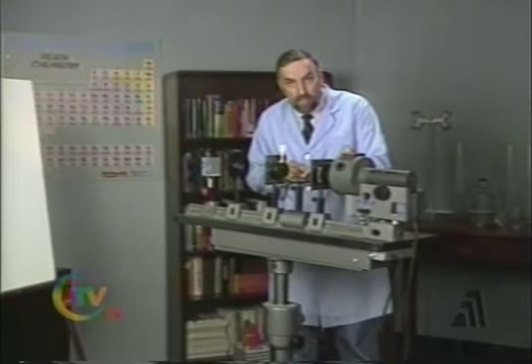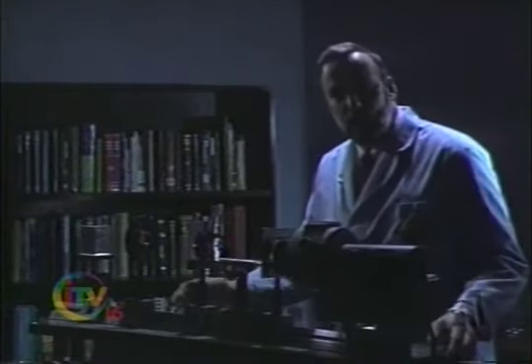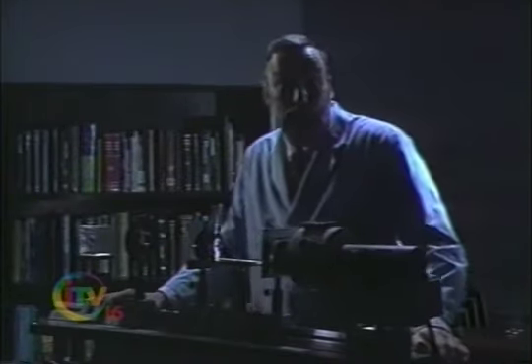Let's first see what the spectrum looks like without a sample in there. All right, we're going to turn off the room lights and turn on the spectroscope. The colors we see are the ones we're all familiar with: violet, blue, green, yellow, orange, and red.